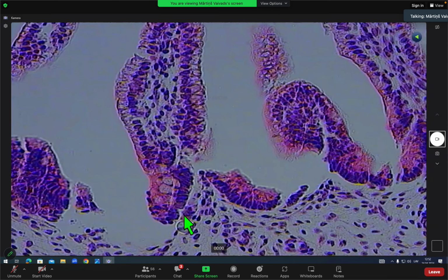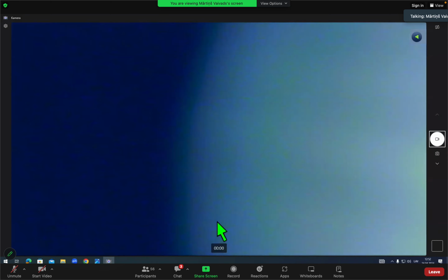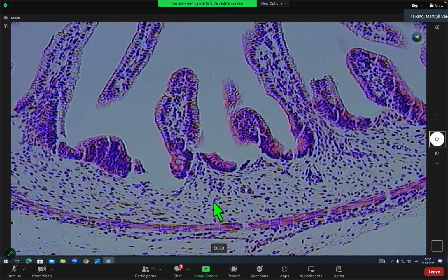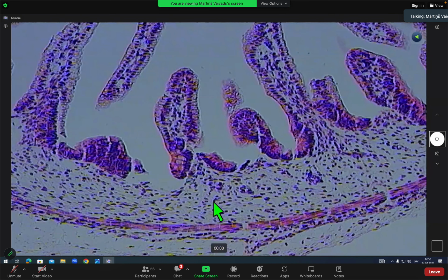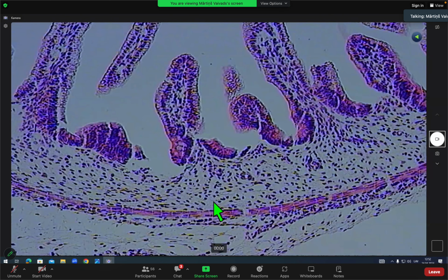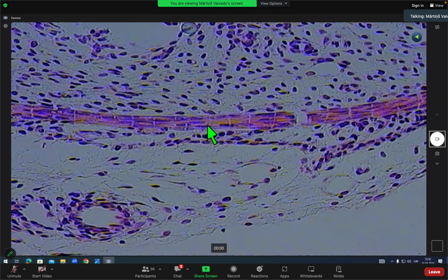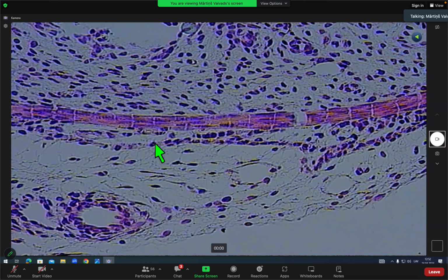Intestinal villi are visible. And remember, when we talk about the connective tissue here, this is connective tissue of mucosa and the submucosa. So you name mucosa, submucosa together here. Then tunica muscularis, very thin. Inner circular layer is 3 cells thick, outer longitudinal layer 1 cell thick. Very thin layer, as you can see. Both of them form the tunica muscularis or muscularis externa, that would be the correct name.